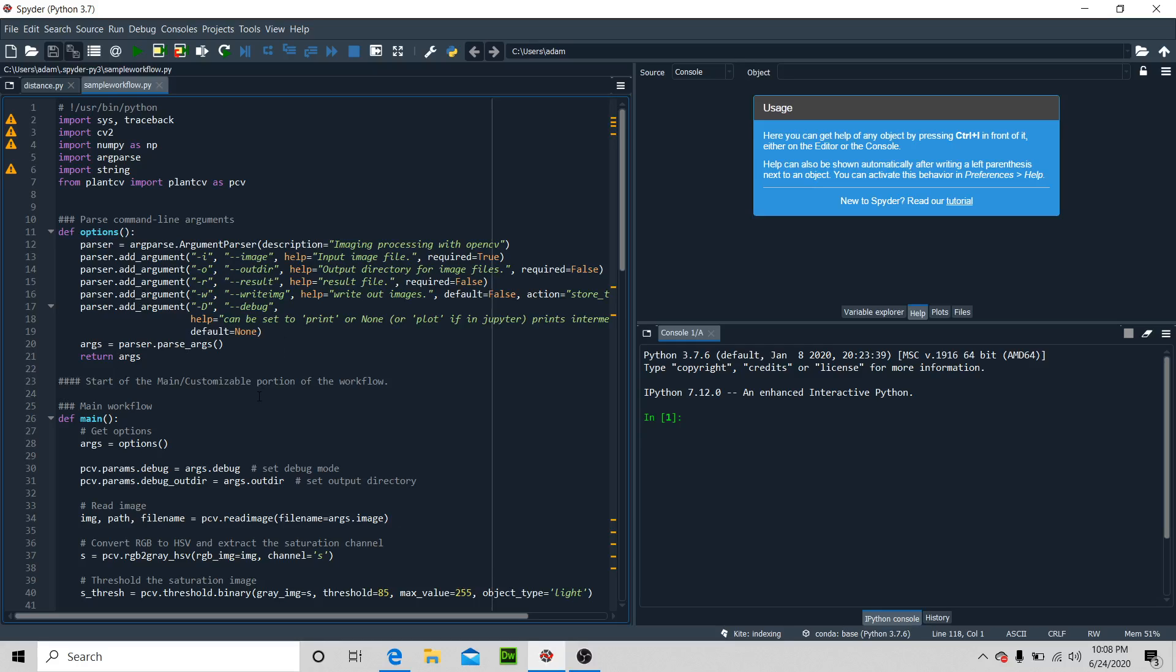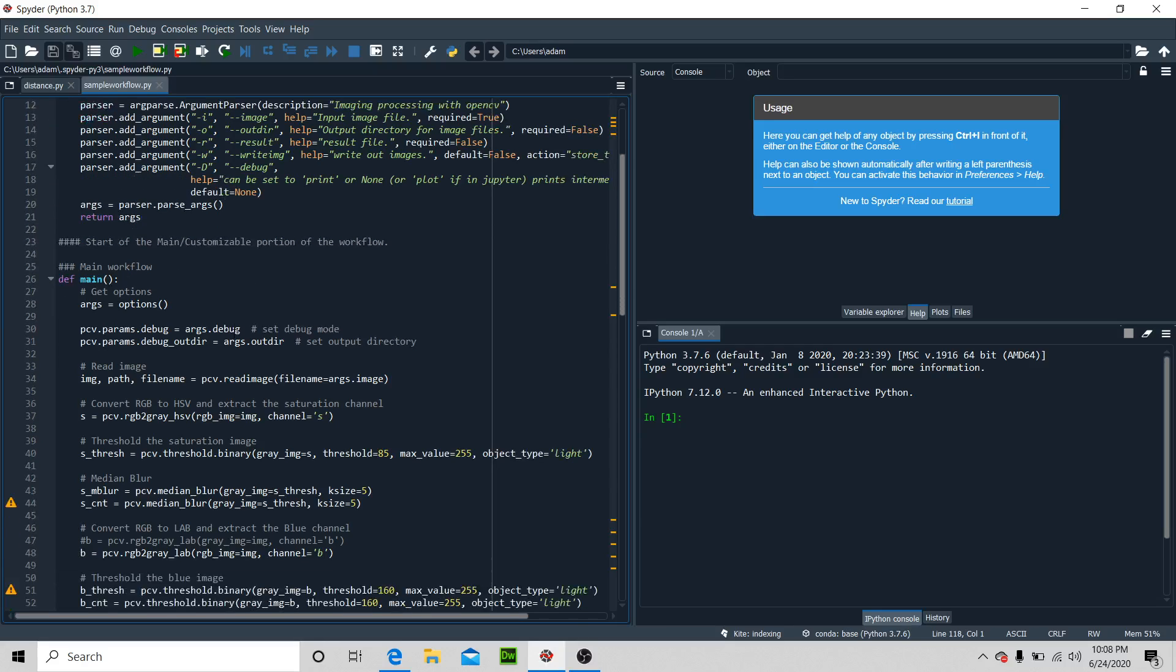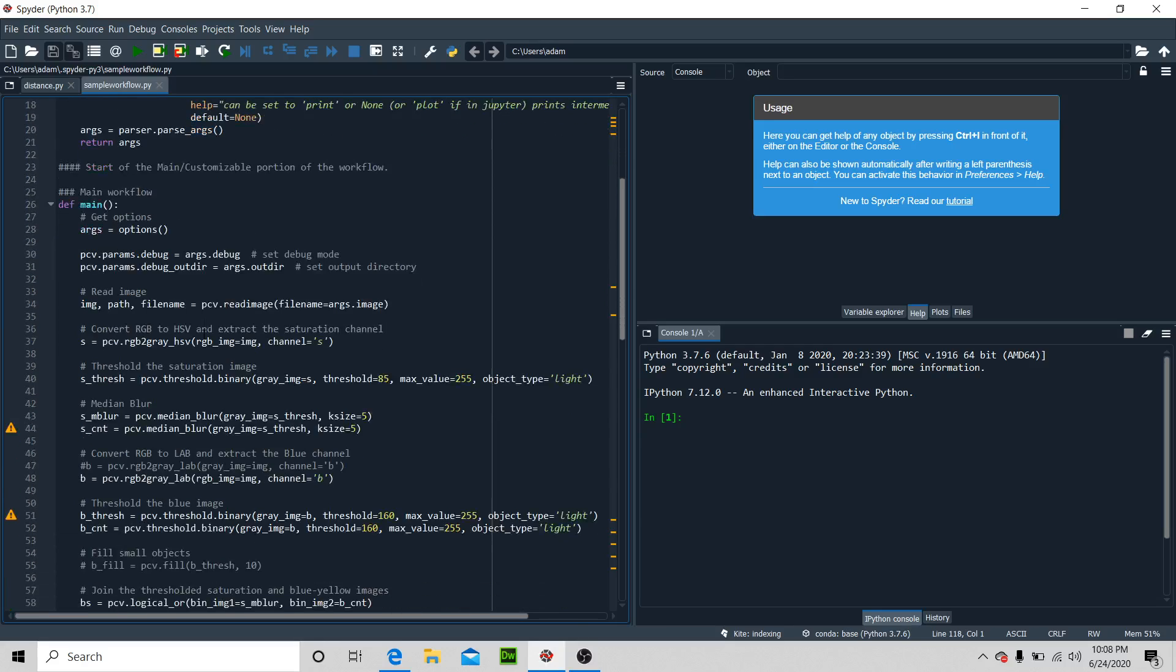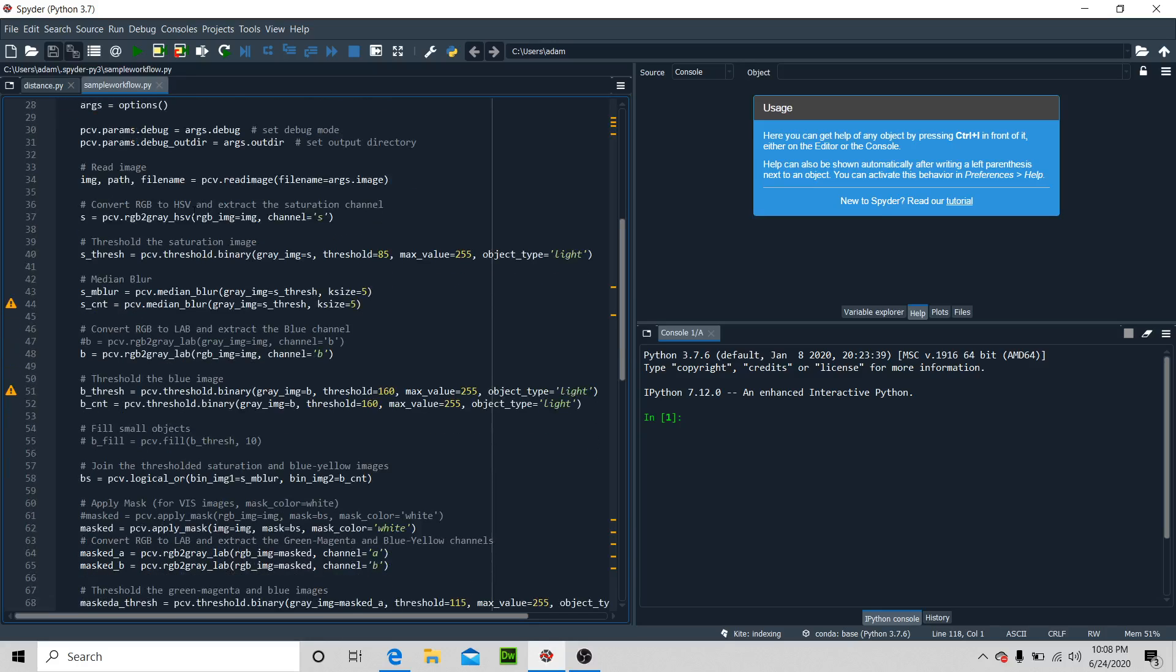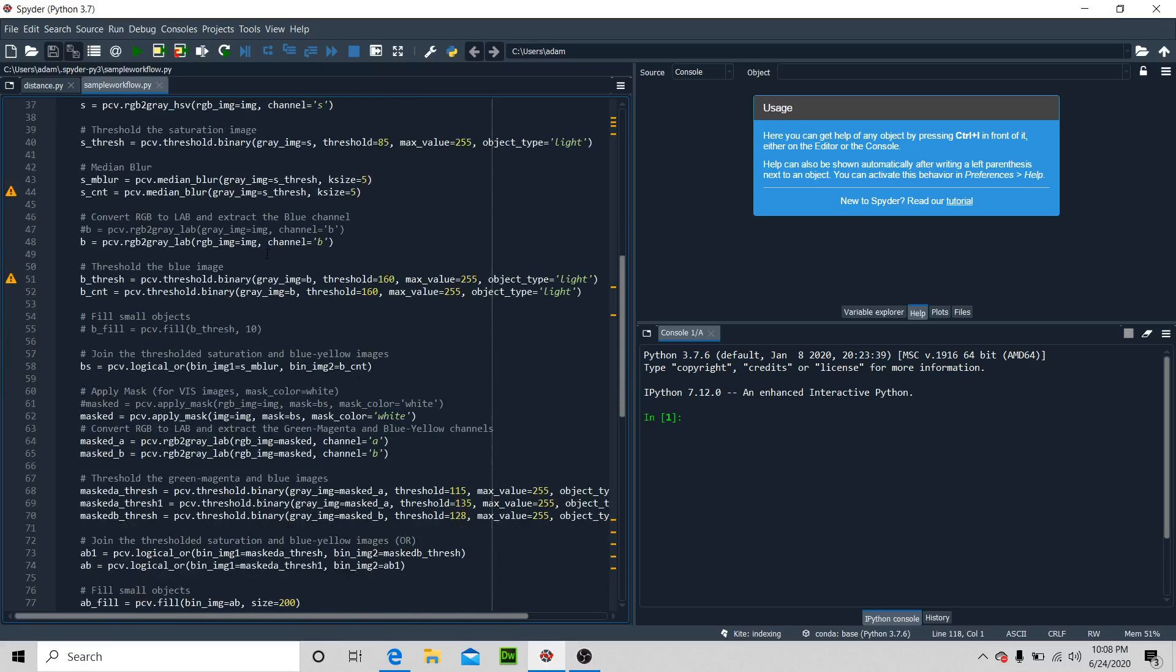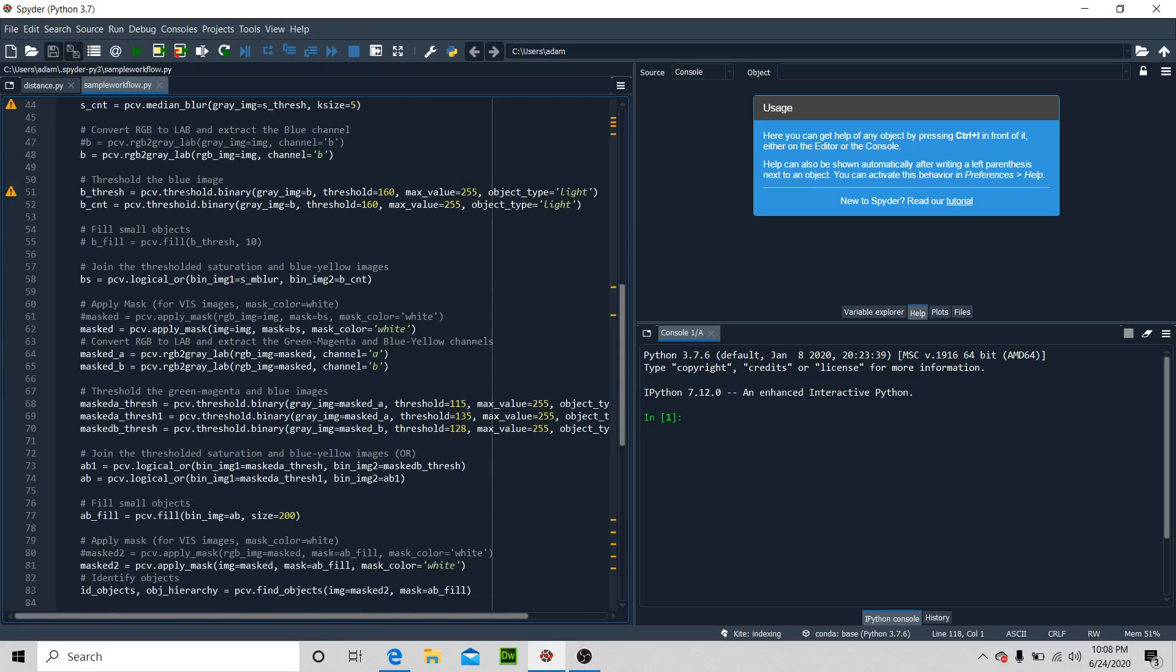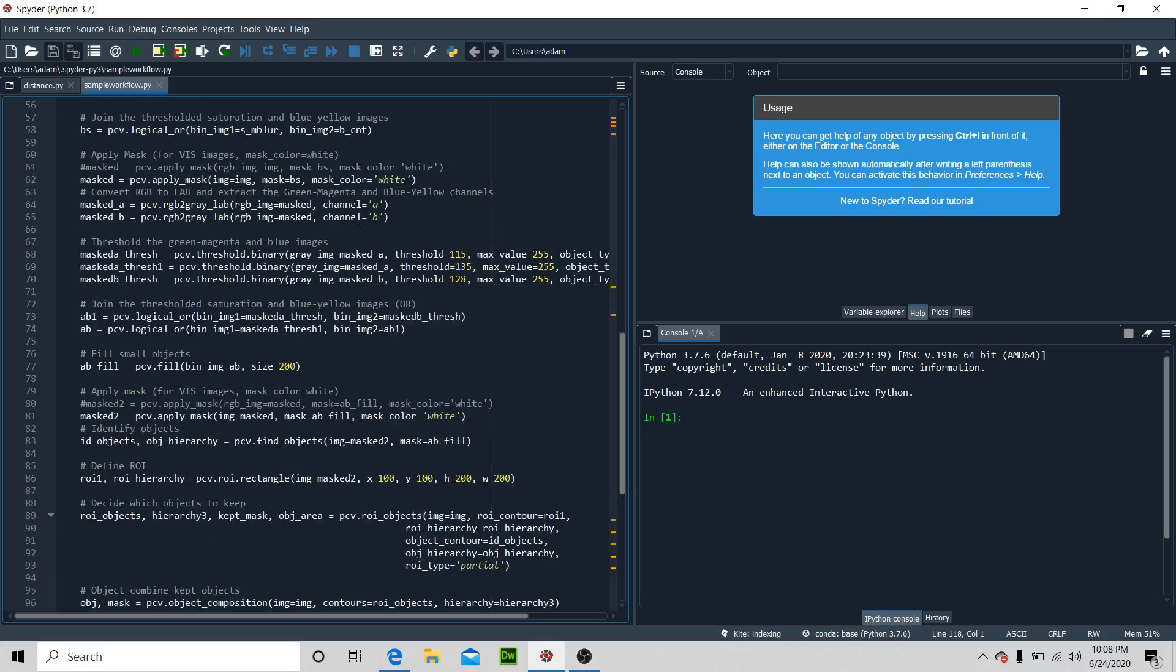Okay, let's look at it real quick. We have a couple arguments here. We have this main workflow where we can get these arguments, these parameters, and we can set the output. We can read the image and then convert it from RGB to HSV and extract these saturation levels. You can edit the threshold and stuff like that, and then we can do a couple more things.